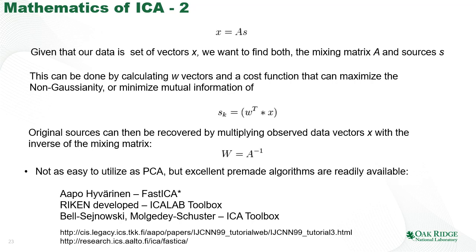In other words, given this cocktail party example, you are listening to only one person who talks about one topic. You don't listen to the person standing next to you talking about something totally different. The ICA is not as easy to use as the principal component analysis, but there are a lot of available algorithms, either in scikit-learn or FastICA, and many other tools which are available now or will become available in the near future.